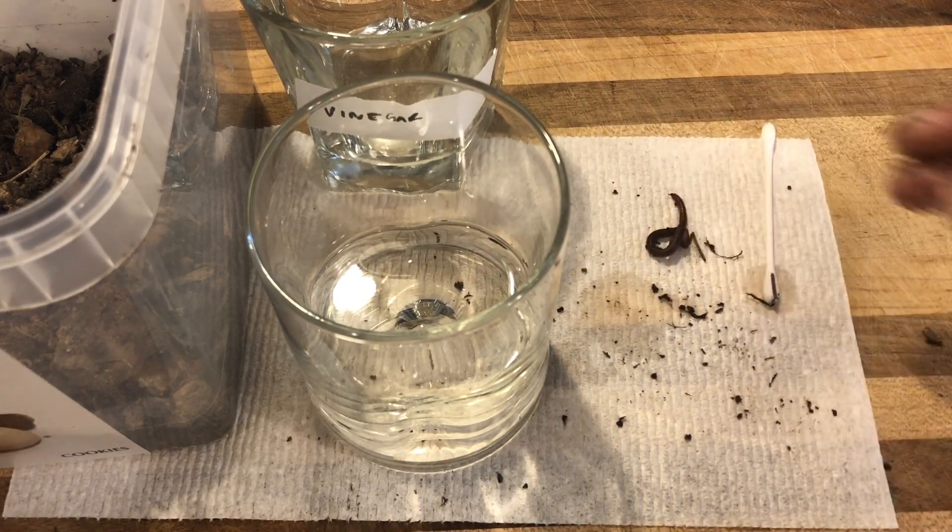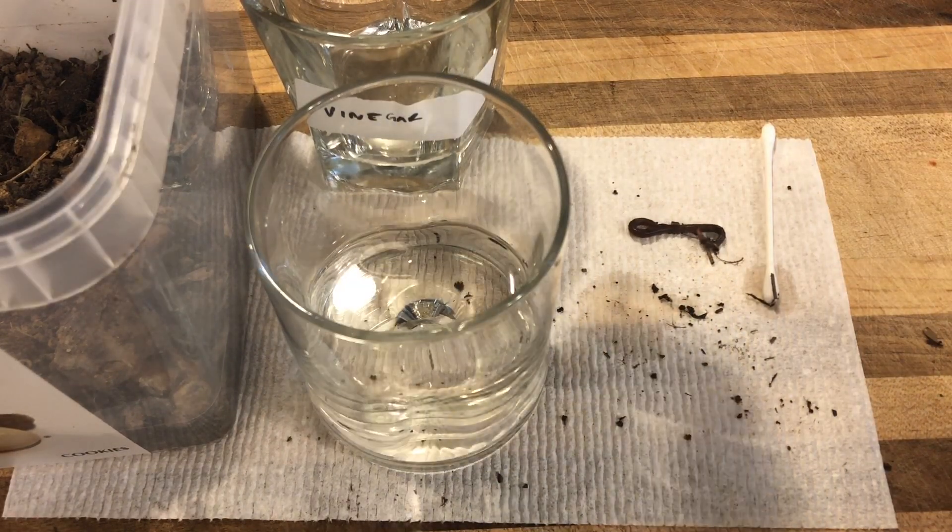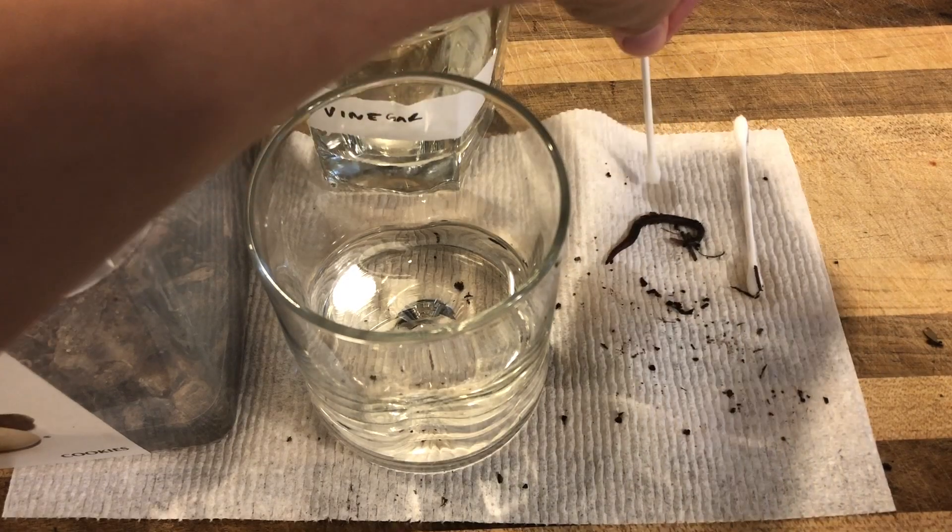Now put your earthworm in a new area of your paper towel and do the same with a line of vinegar. Be careful not to touch the worm with the vinegar.